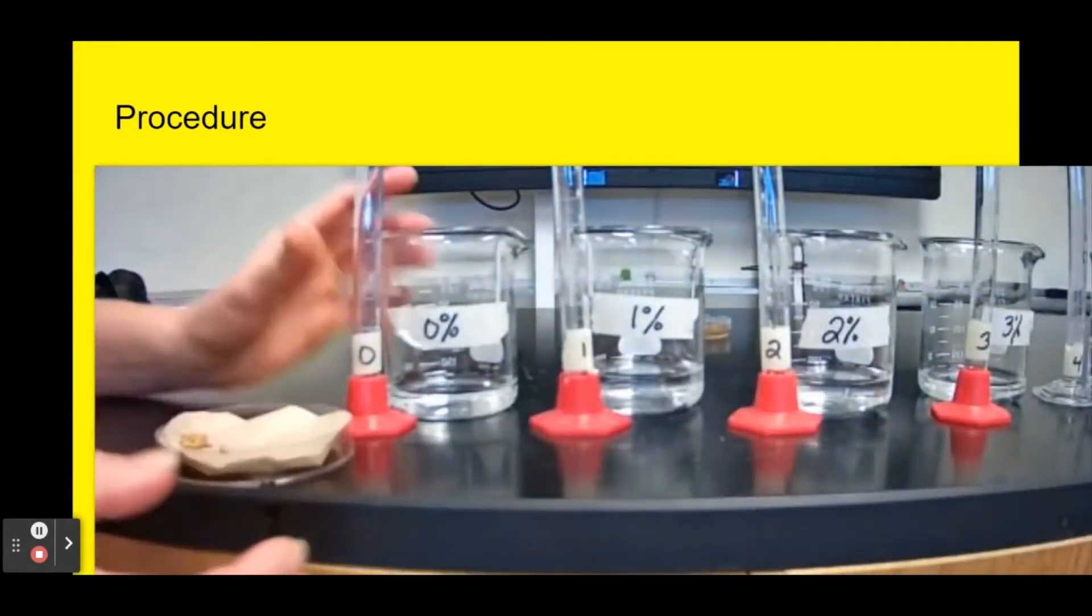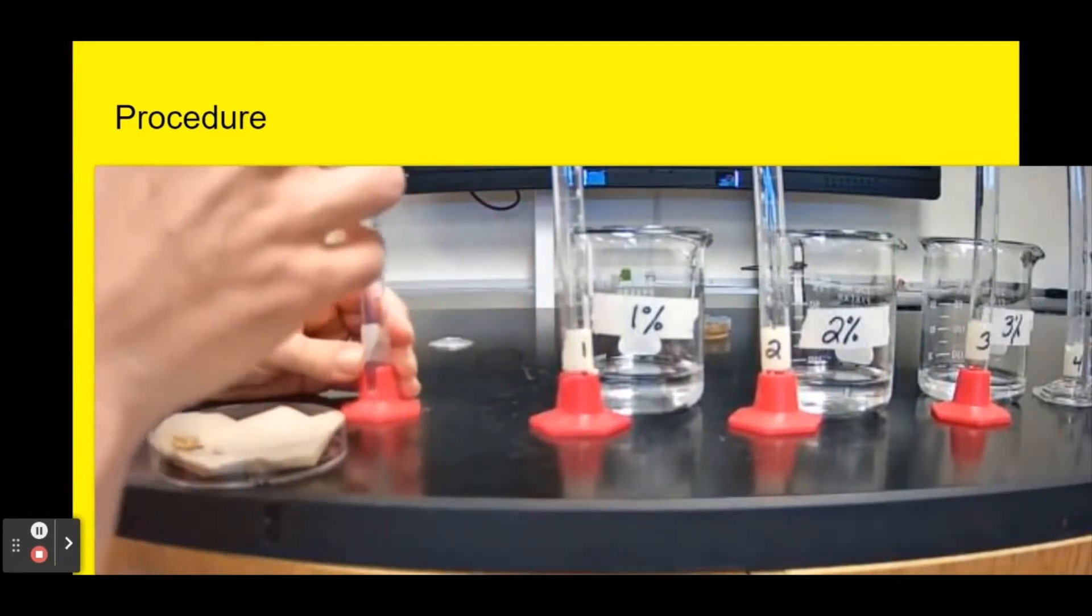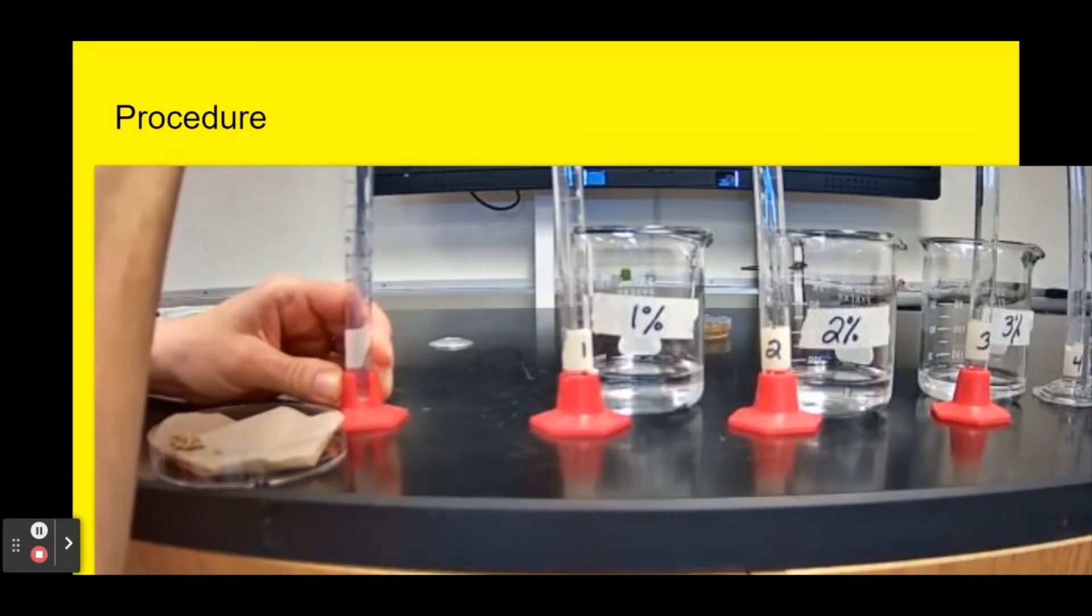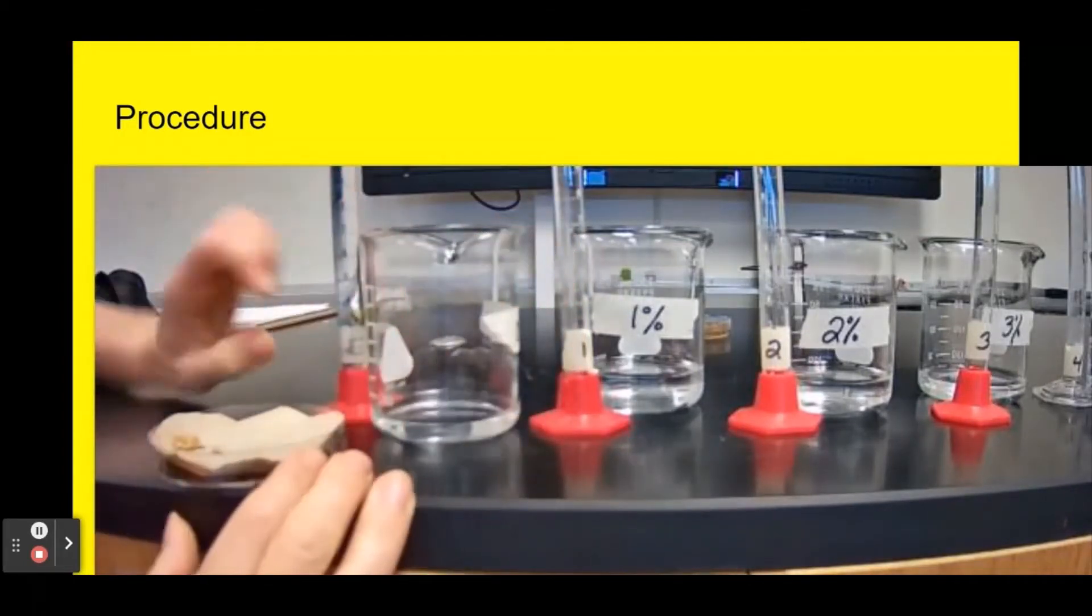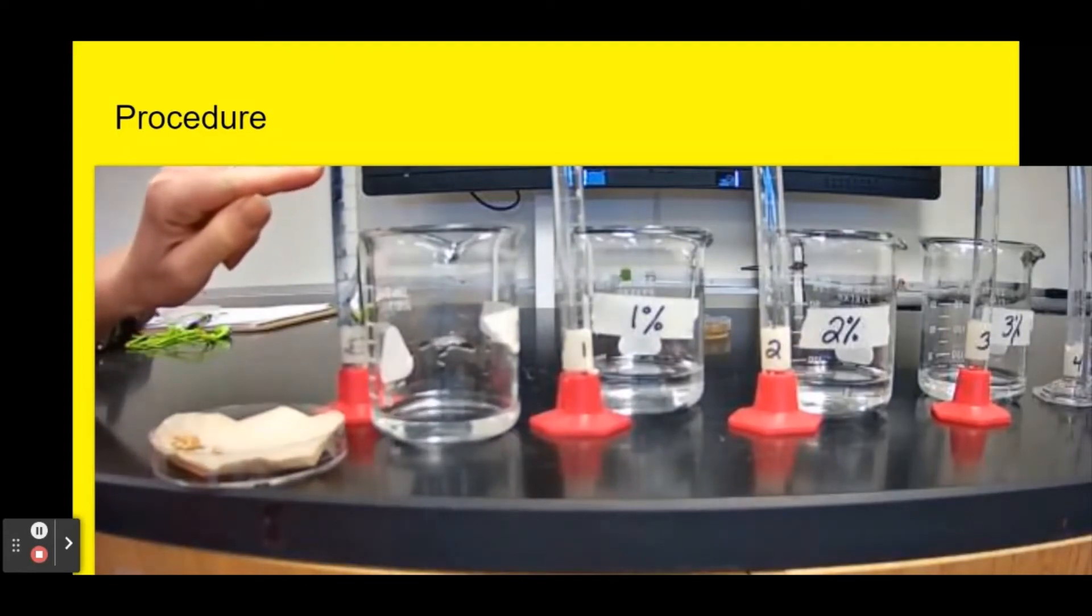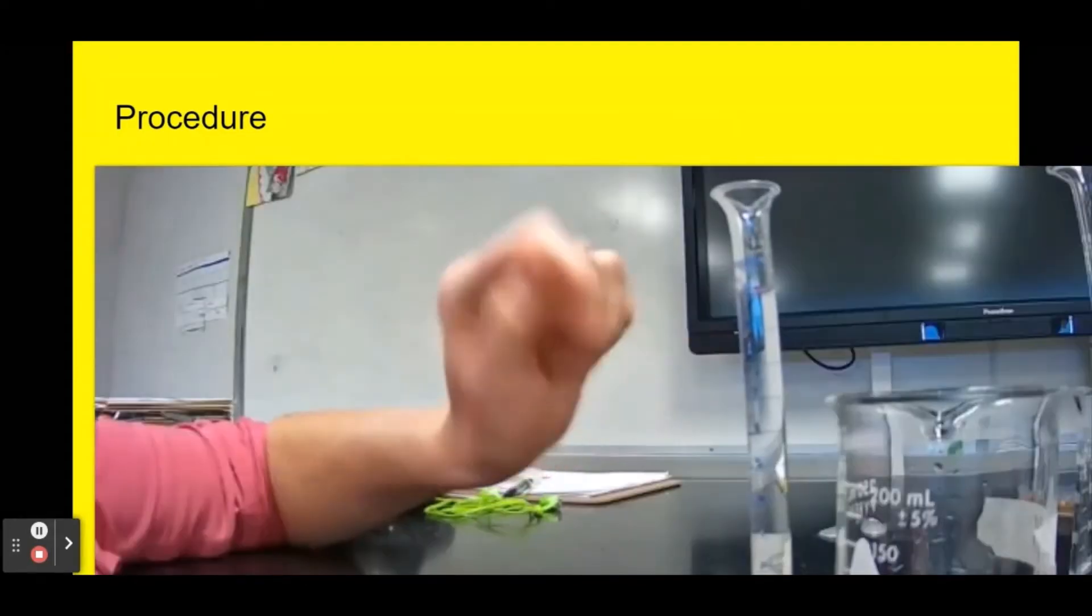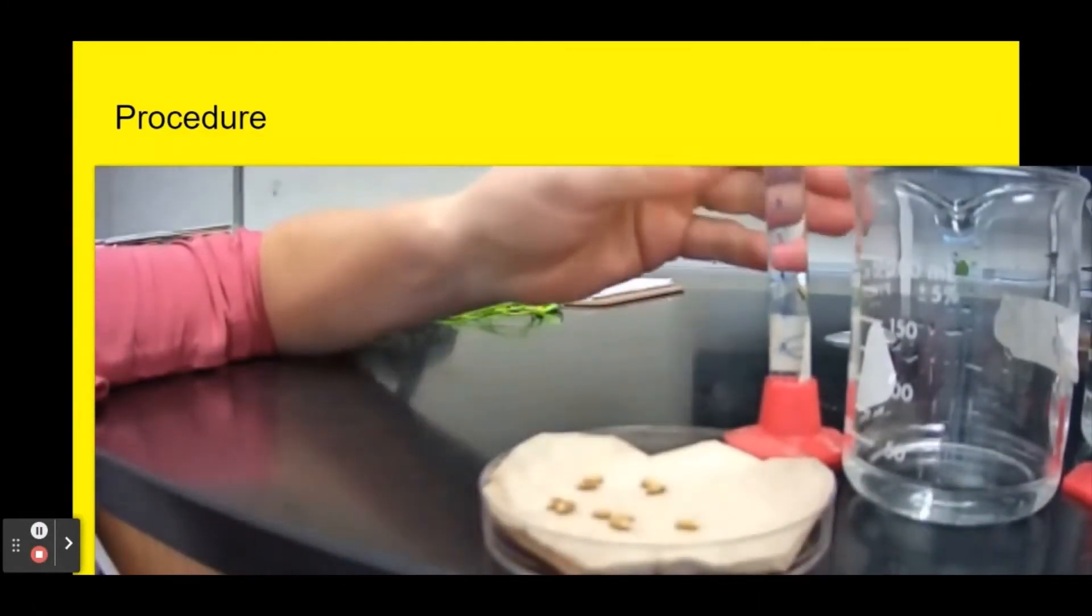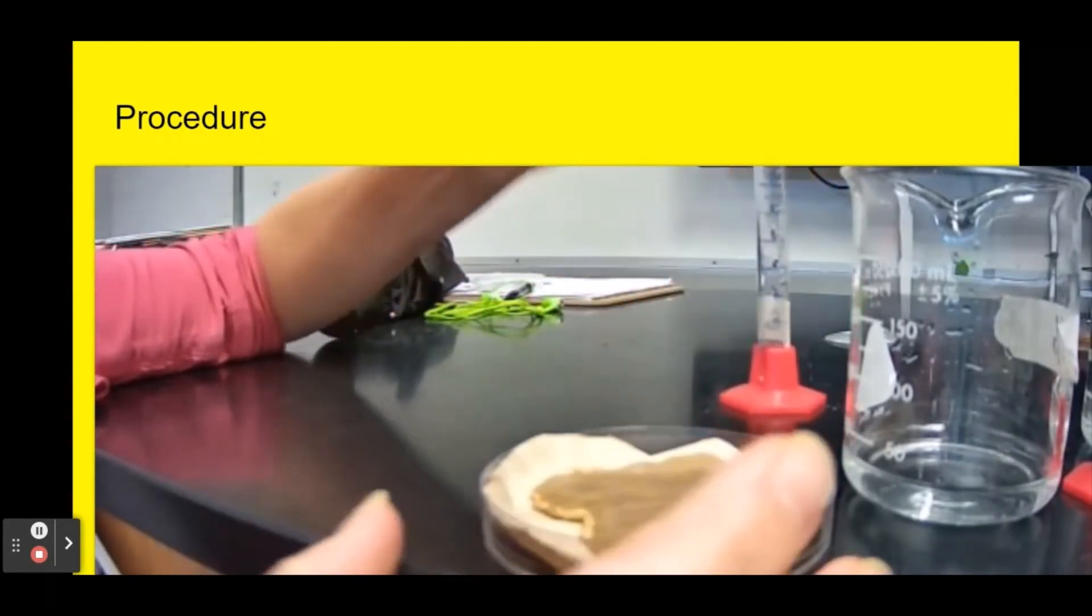Here I am with my zero percent solution, so this is just water. This will be my control group so I will know how the seeds perform without any simulated acid rain. You got to make sure you are at eye level so that you can see that the bottom of the meniscus is at 10. I'm going to spread my seeds out a little bit on my tray and pour in 10 milliliters of water.